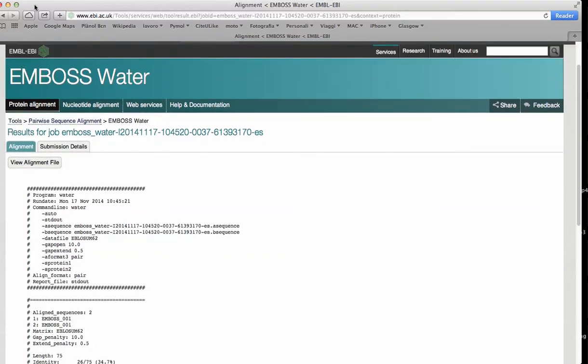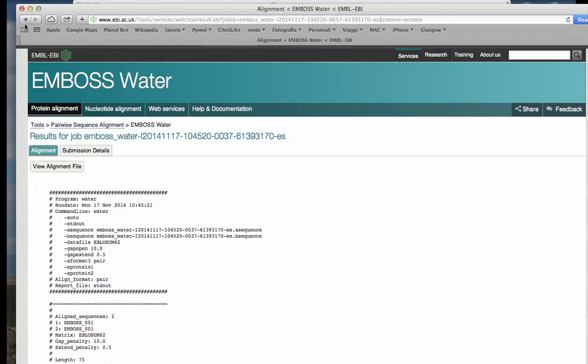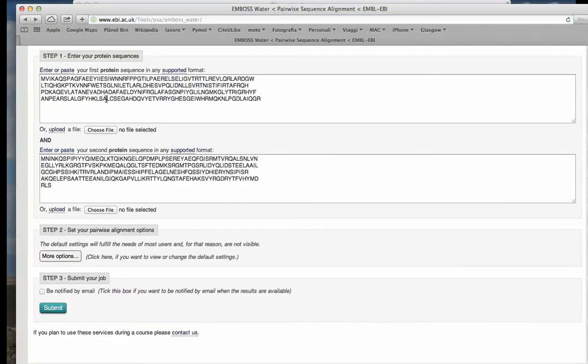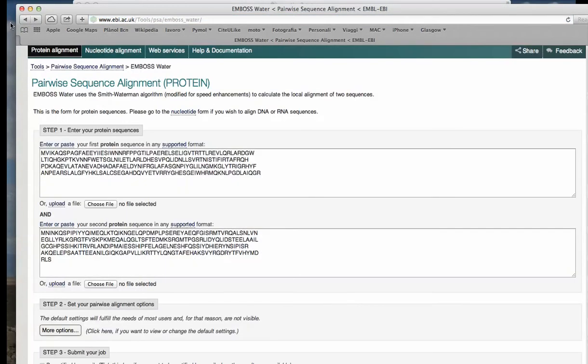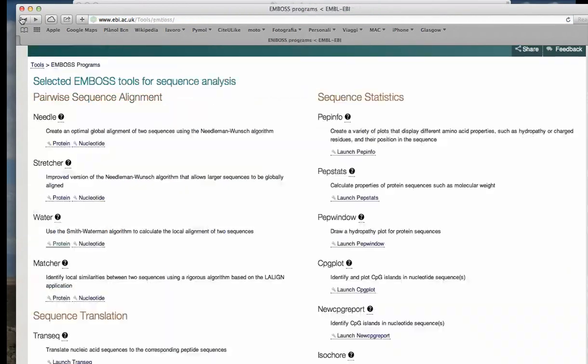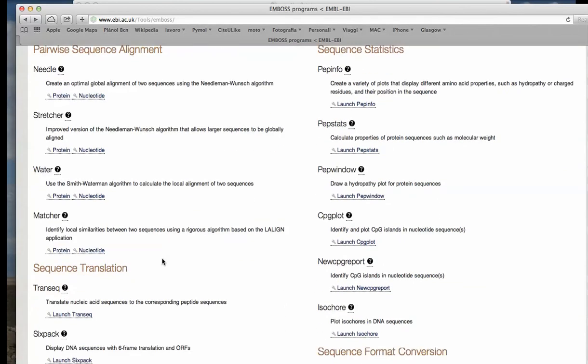Well, basically, this is the tool for align sequences, for the pairwise alliance of sequences. We can use other algorithms that are as good as we described in the lessons.